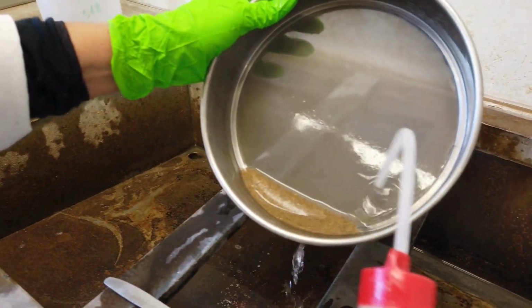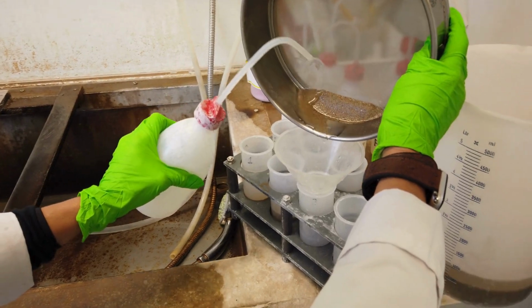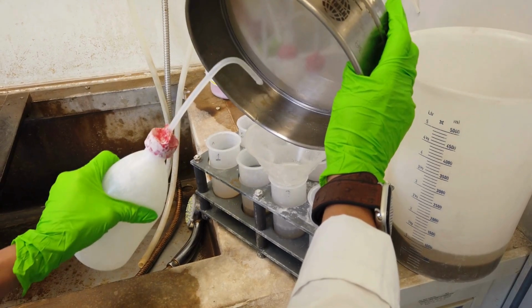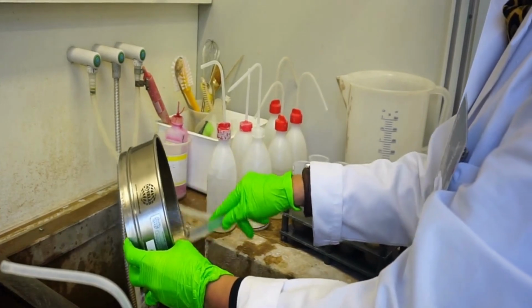The sediment is concentrated to one side of the sieve. Then the sediment is transferred to the centrifuge tubes using Ludox. The sediment to Ludox ratio should be about 1 to 10. It is important to rinse the materials each time you change samples.